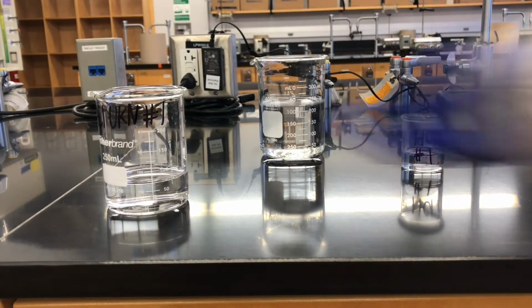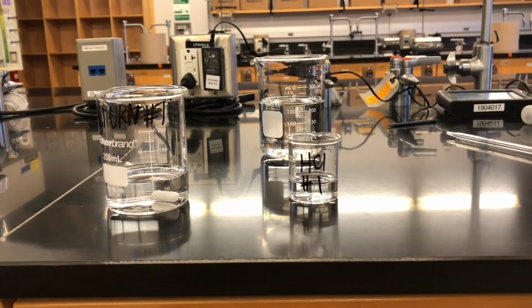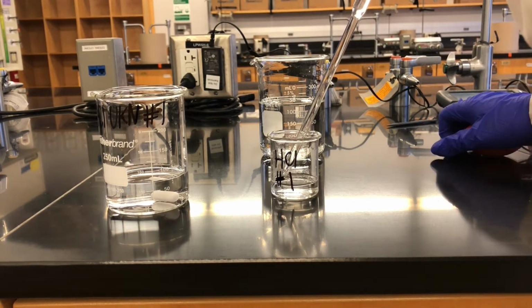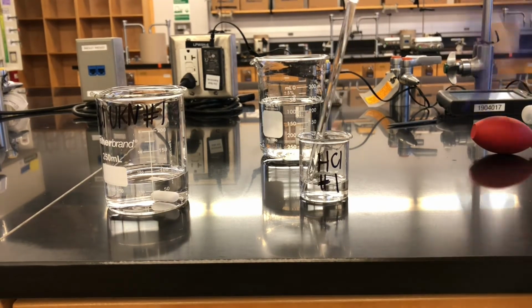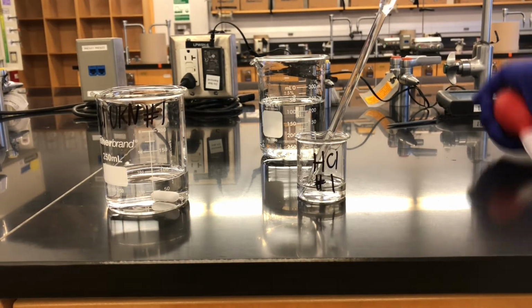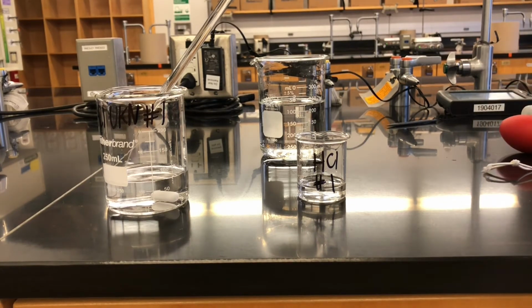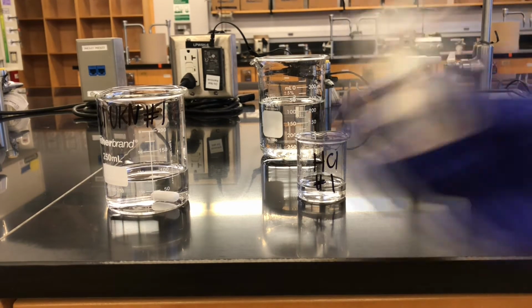First, we will prepare the solution that we'll titrate into. In a clean 250 milliliter beaker, we add approximately 75 milliliters of water. The exact volume doesn't matter for the water, but for the unknown hydrochloric acid, we need a highly accurate volume. Therefore, we measure the 5 milliliters of the unknown HCl sample with a 5 milliliter volumetric pipette. We also add just a few drops of our phenolphthalein indicator and a stir bar before placing it on top of the stir plate.